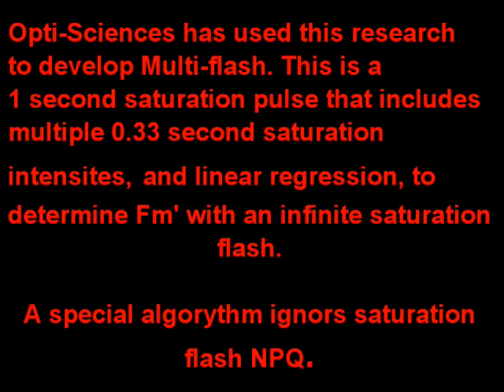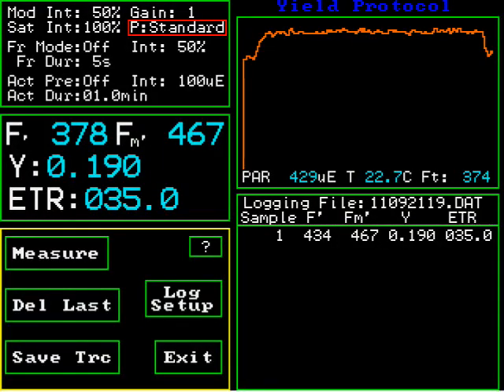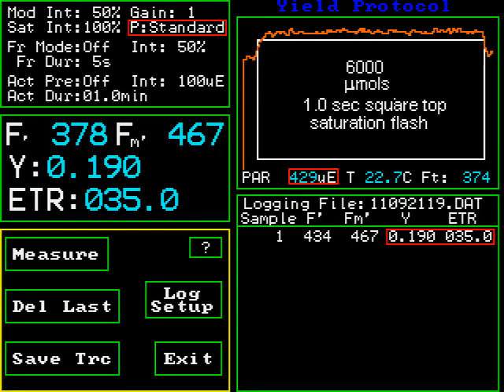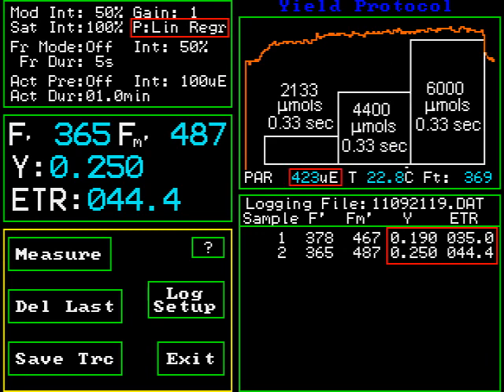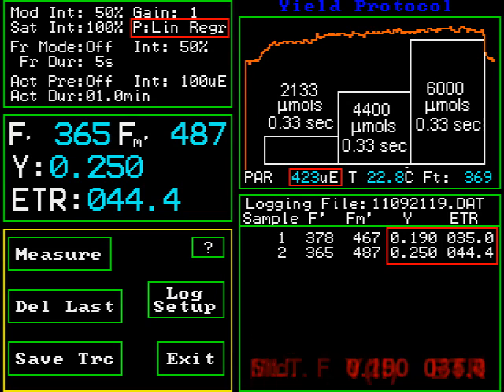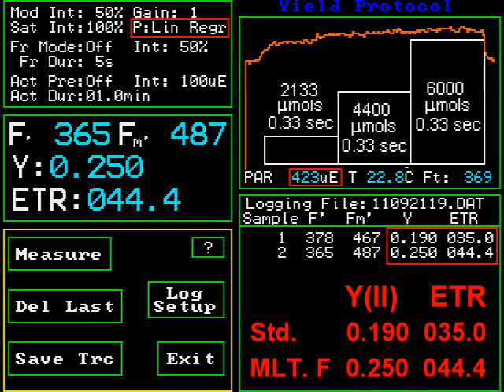A special algorithm ignores saturation flash NPQ. This screen shows a sun maple leaf measurement with a standard square saturation flash at 6,000 micromoles. The same leaf was then measured using multi-flash, with each flash duration of 0.33 seconds and increasing intensity from 2,100 to 6,000 micromoles. The quantum yield of PS2 is more than 30% higher using multi-flash in this instance.